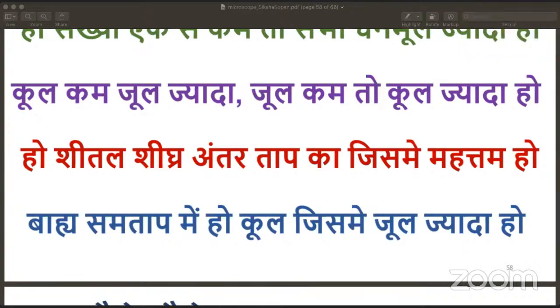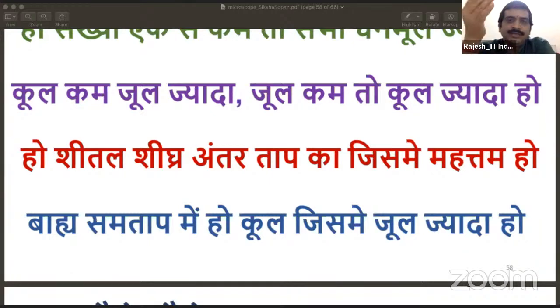Yes, sir. Now there are newer technologies where instead of tungsten there is a porcelain-like material called lanthanum hexaboride. If you use metal, we all know the heating effect of metal. Because of that, these filaments become saggy, so they need to be replaced several times. So now lanthanum hexaboride is used, but the principle remains the same.